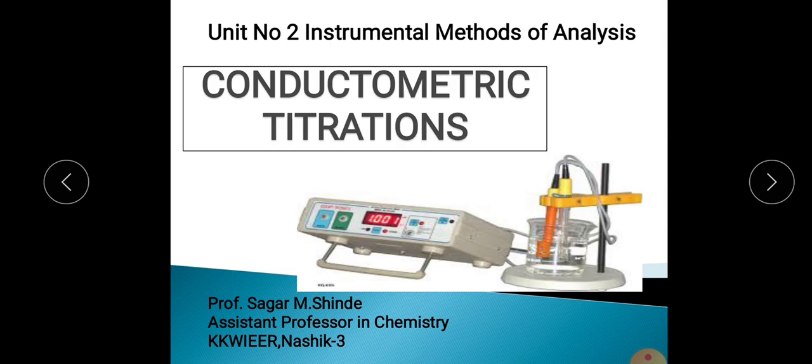A number of instrumental methods are there, like pH metry, potentiometry, conductometry. Out of these, in today's session, we are going to study the analysis by conductometry. Particularly here we are going to study the conductometric titrations. So our today's topic is conductometric titrations.